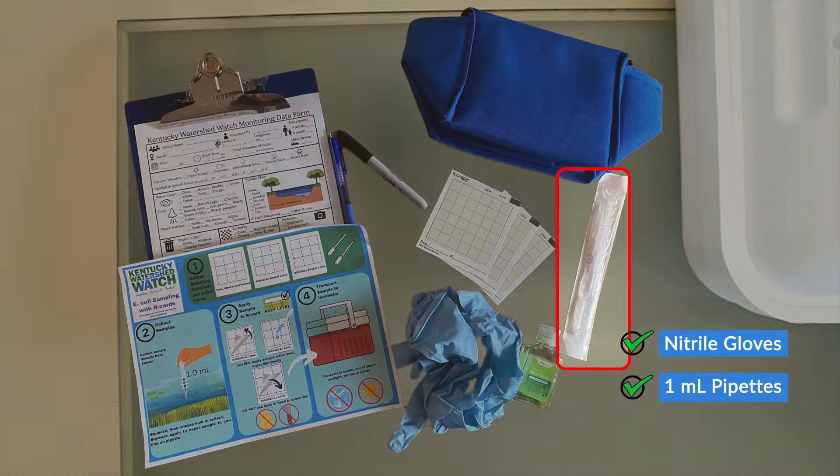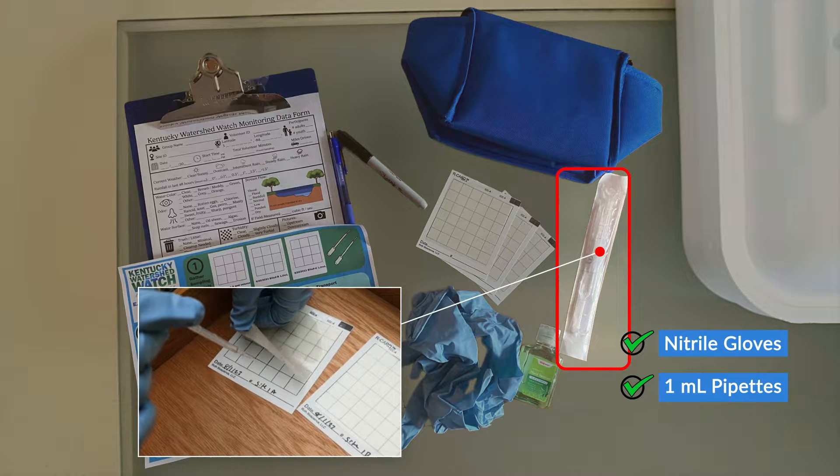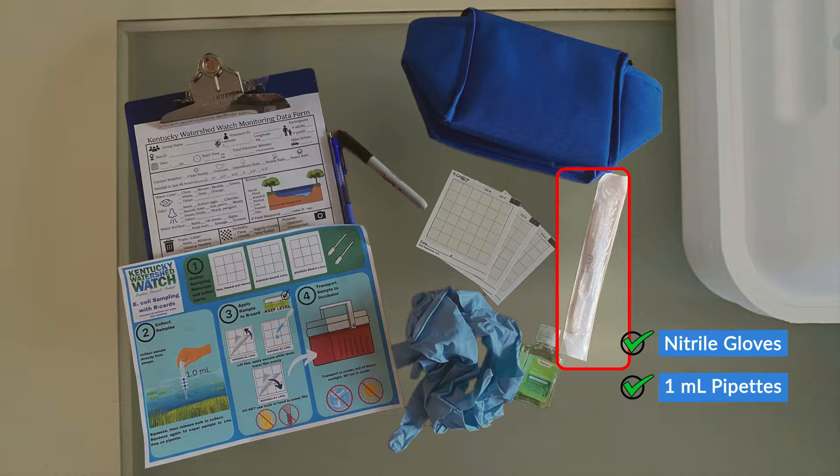Next, you'll want to pack multiple one milliliter pipettes. These are used to transfer the water from our source to the R-cards. You want to bring extras in case of loss or contamination. Please remember that the sample volume required will vary based on the test method that is used.